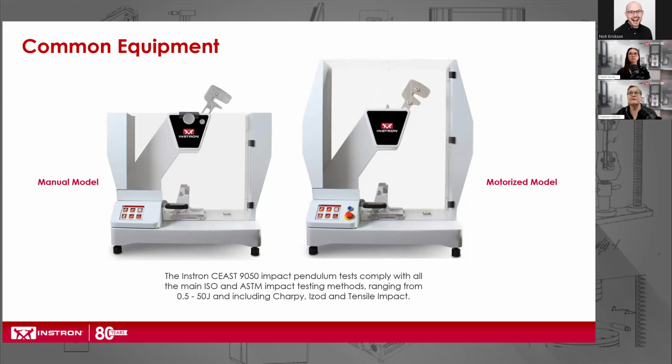This system, as I said, is more for heavier capacity hammers, as well as if you might have a lot of different operators and you want a little more consistency in time of release and making sure that the drop angle is at the same height.